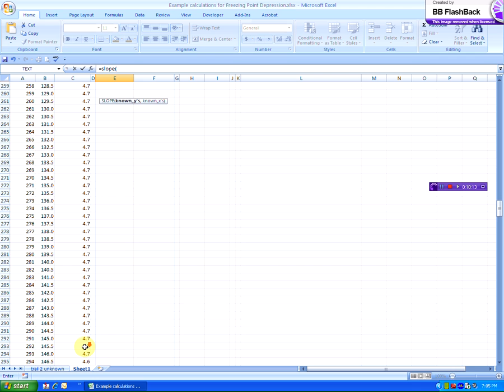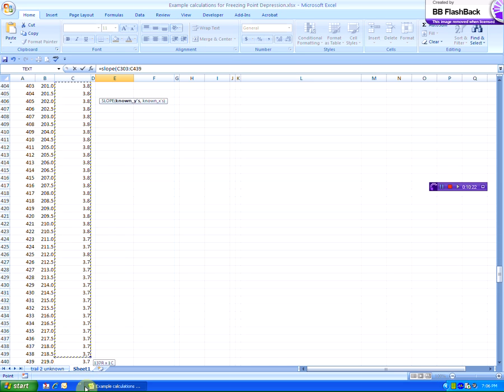So notice we've collected lots and lots of data. Okay, I'm going to click and drag until I get the very last data point.